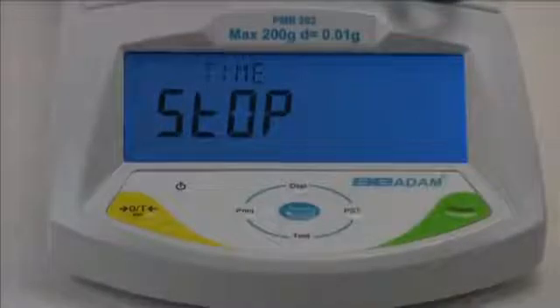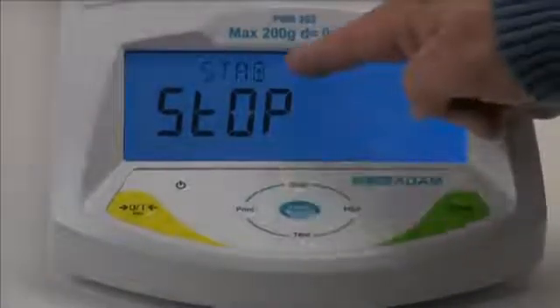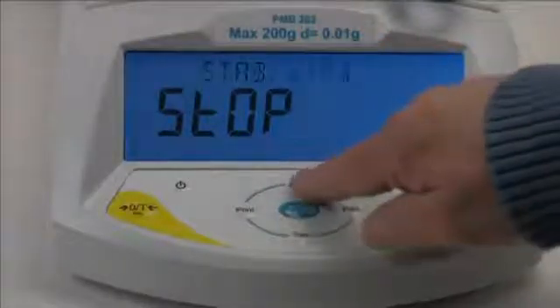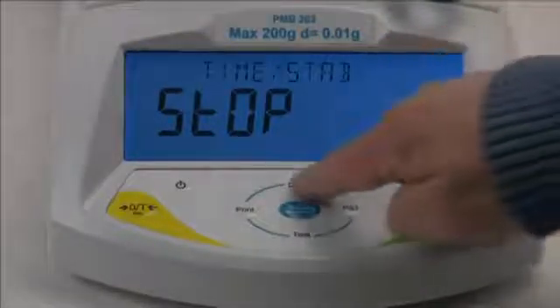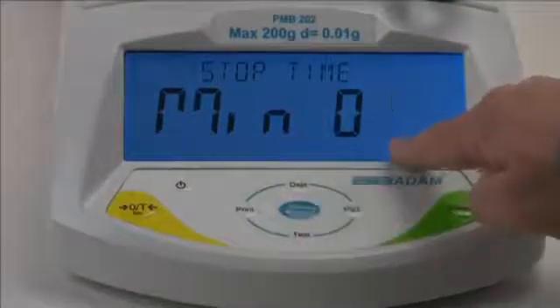Next we will select a stop condition. The test can be stopped automatically after a set time, or after the sample is stable meaning weight loss has virtually ended, or a combination of these. For our demonstration we will run the test for 4 minutes then stop.